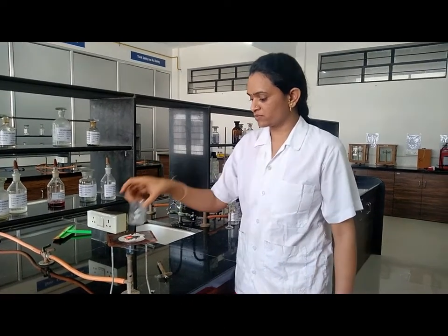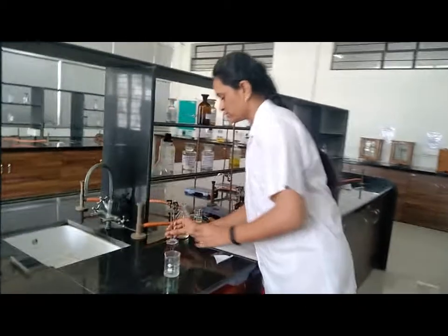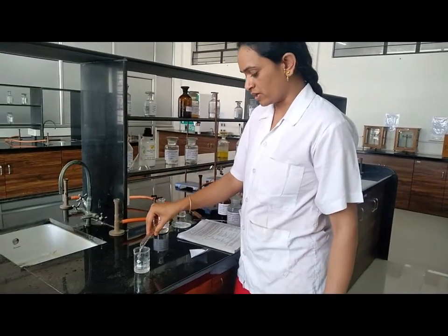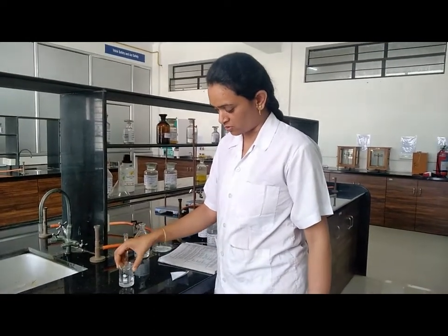Now we are boiling this for 3 minutes. Now we have to add 10 ml of sulfuric acid solution. We have already filled this measuring cylinder with 10 ml of sulfuric acid. Add this solution into the boiled solution. Then keep this solution for 2 to 3 minutes.